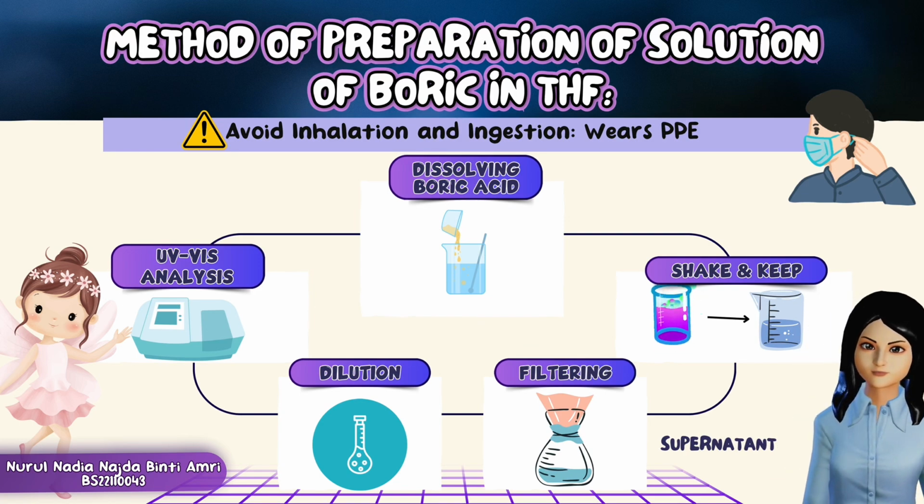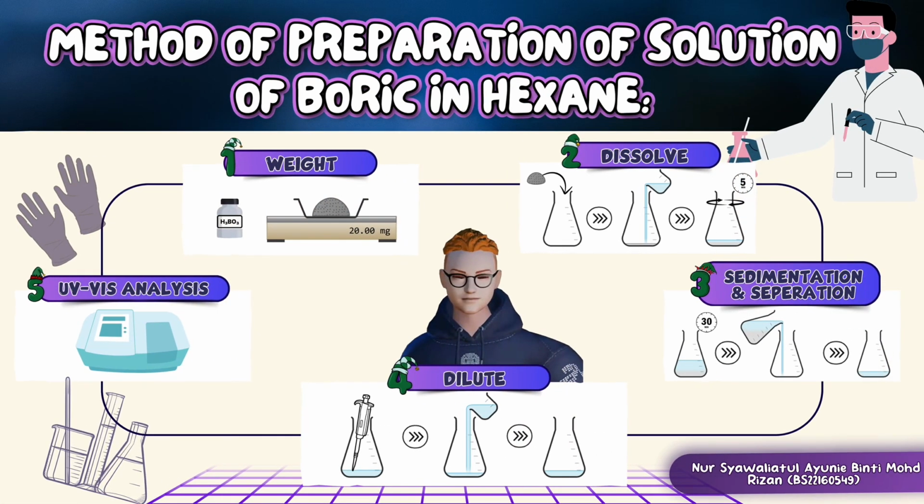The spectrum also displayed a broad dip with overlapping features. This characteristic is attributed to interactions between boric acid and water molecules. Such interactions can alter the electronic environment of the system, leading to changes in the absorption spectrum.